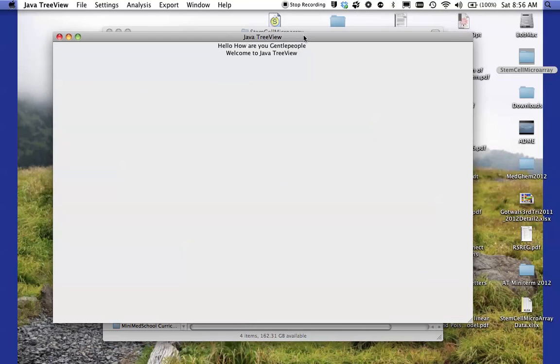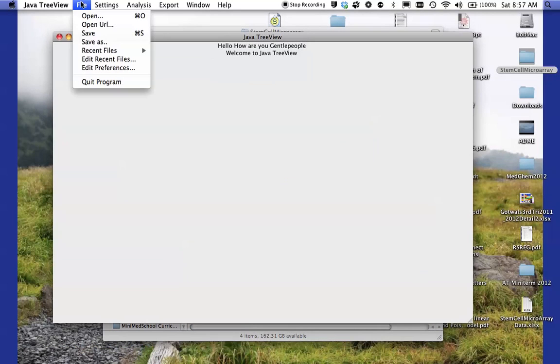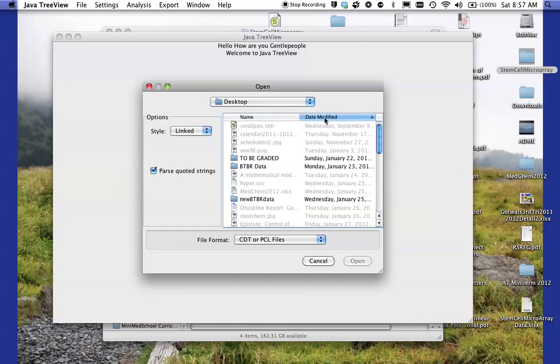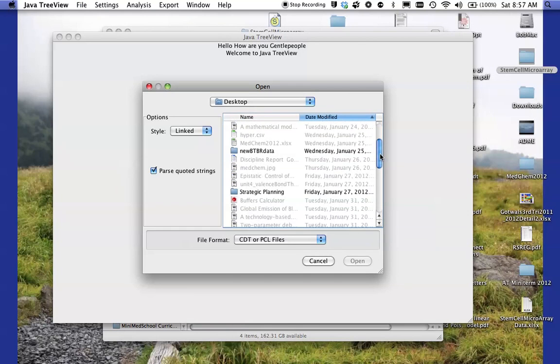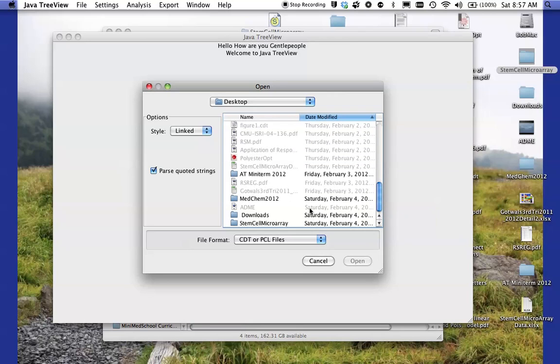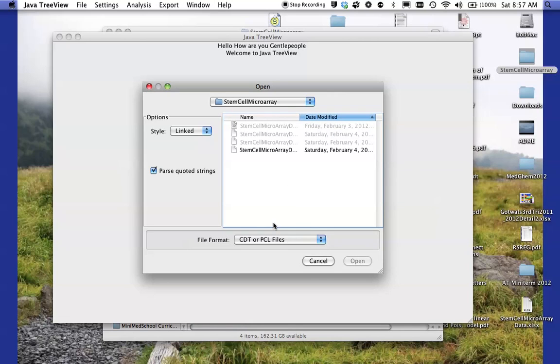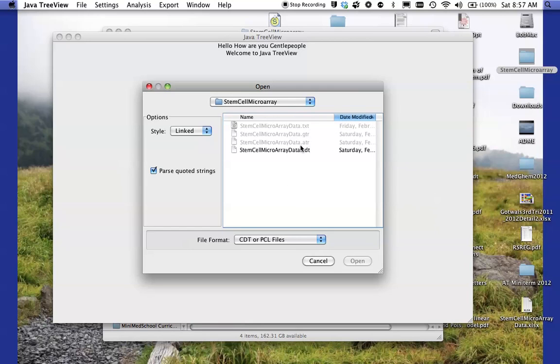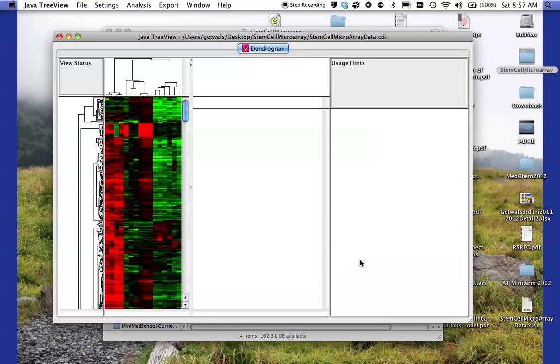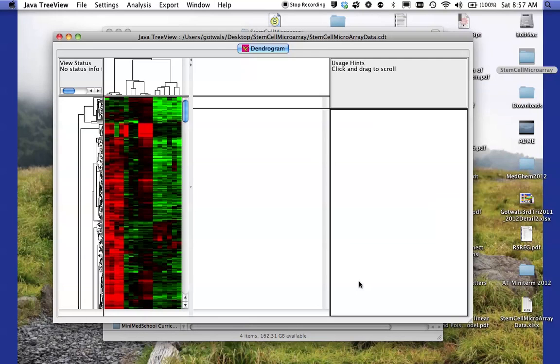And it gives a pretty plain looking screen. I'm going to go up under file and I'm going to say open. And again, go find, there's my desktop. Go find my, where did it go? There it is, my stem cell microarray folder. I'm going to double click on that. And I'm going to open, the file I want to open is the CDT file. That should be the only one that appears. I'm going to open that.